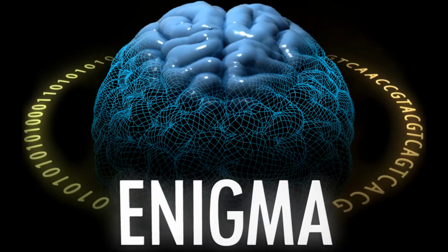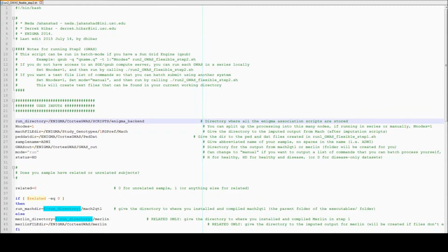In this video, we'll be reviewing how to use the run2_GWAS_flexible_step2.sh script for the ENIGMA-3 GWAS protocol. This script is used to run the GWAS using the files prepared in the previous scripts, outputting the final GWAS results, one file for each chunk of each chromosome. We'll assume that you're working on a Linux machine in the base directory called E3 and that you have already downloaded the association scripts. Open run2_GWAS_flexible_step2.sh and make changes to the following lines.